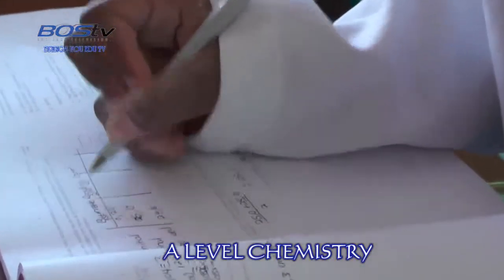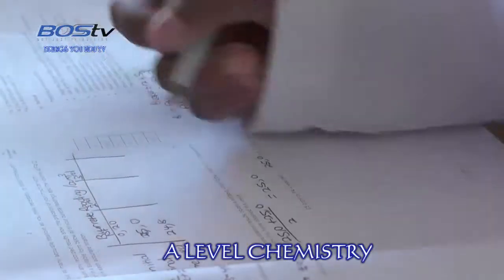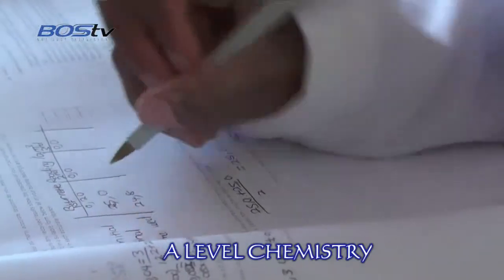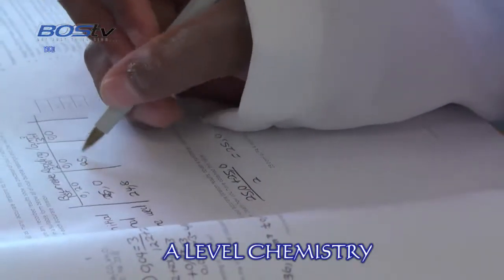You want the calculations. What's your volume? This is the number of moles. The one you use for the three.